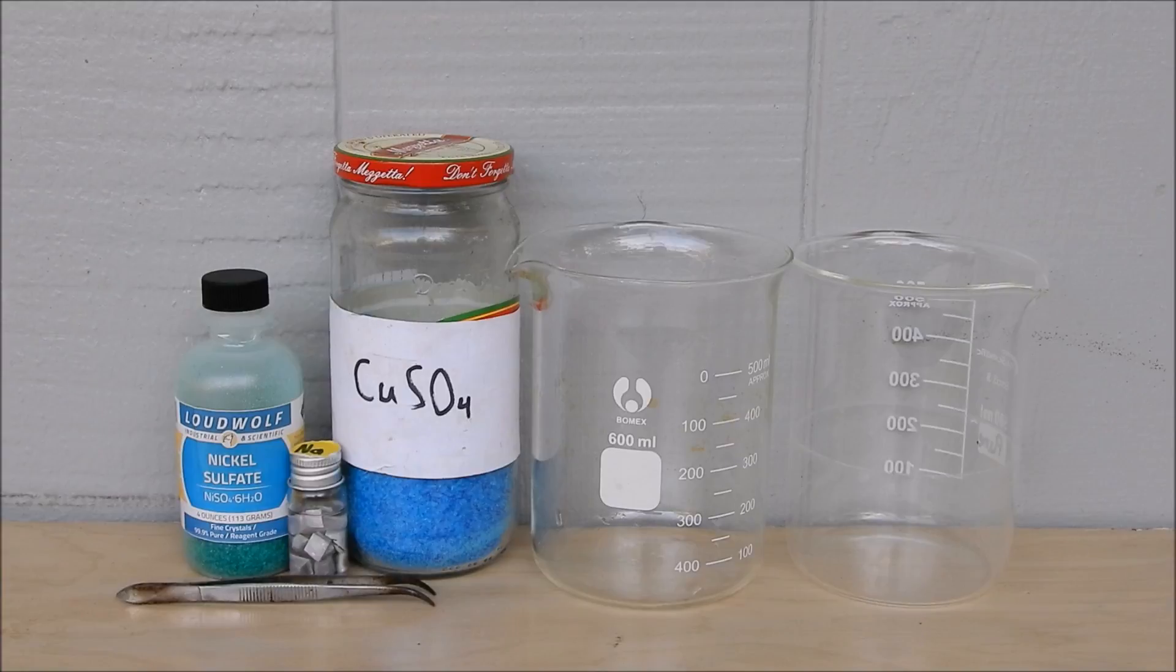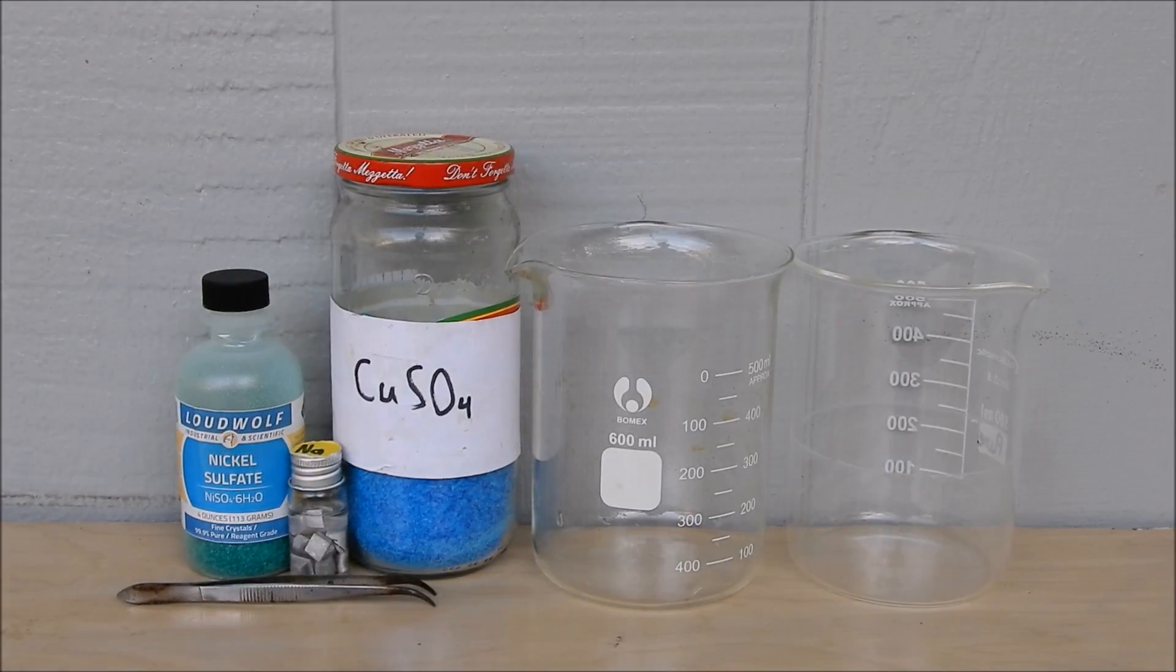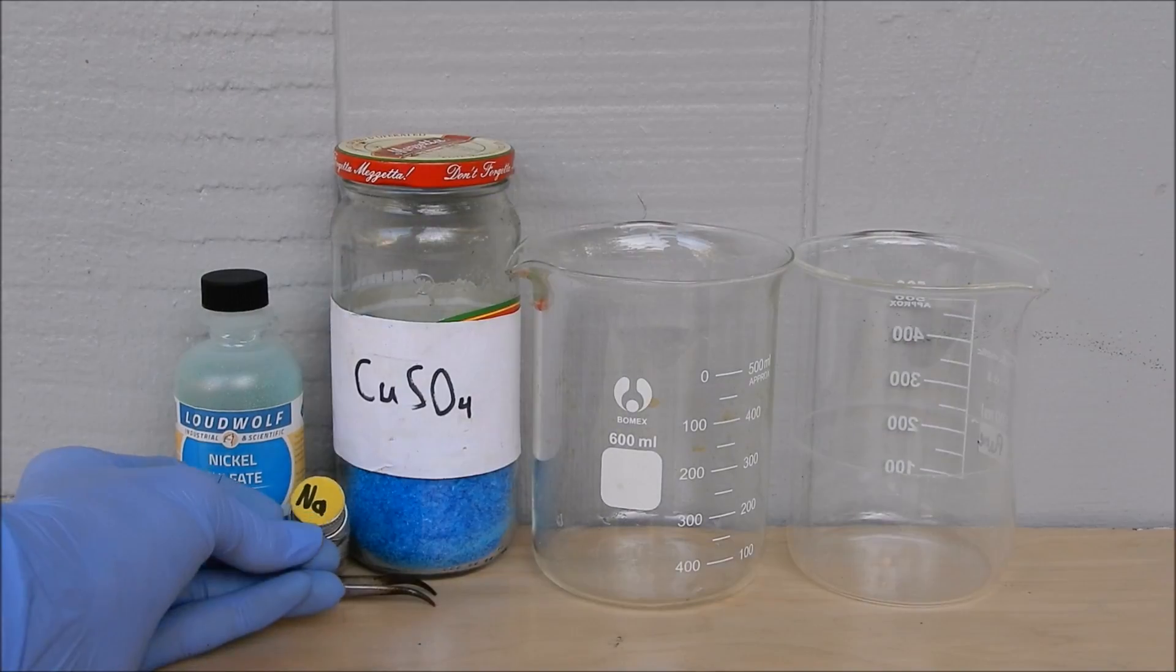Good morning everyone and welcome back to Back Maxi. In today's video we're going to be reducing nickel sulfate to nickel metal using sodium metal, because in my last videos I tried to make nickel metal with magnesium and aluminum and it just didn't work. So I figured why not increase the power of reducing capabilities.